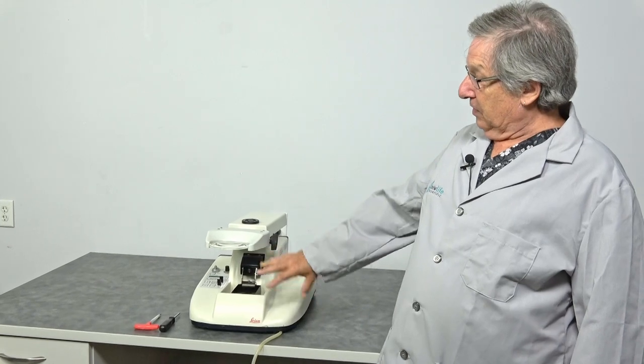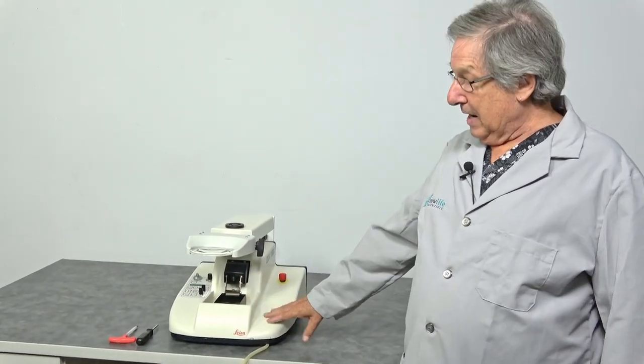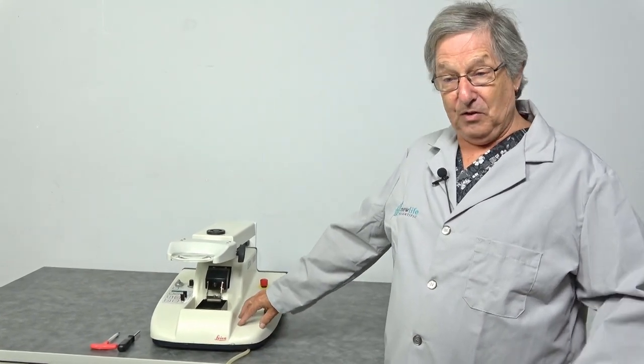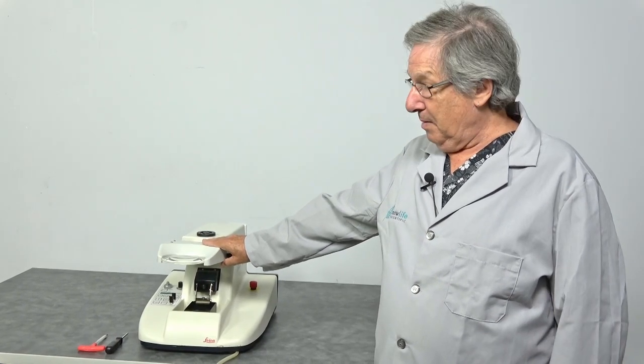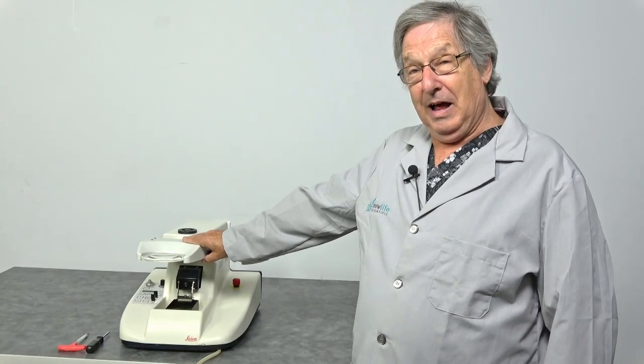We've sold several of these. This is one of our more complete units. We did have to do some work to make it complete. We wanted to show you those features. A lot of the other machines that we see on the market are without them and I had trouble finding images of how this thing works and looks.